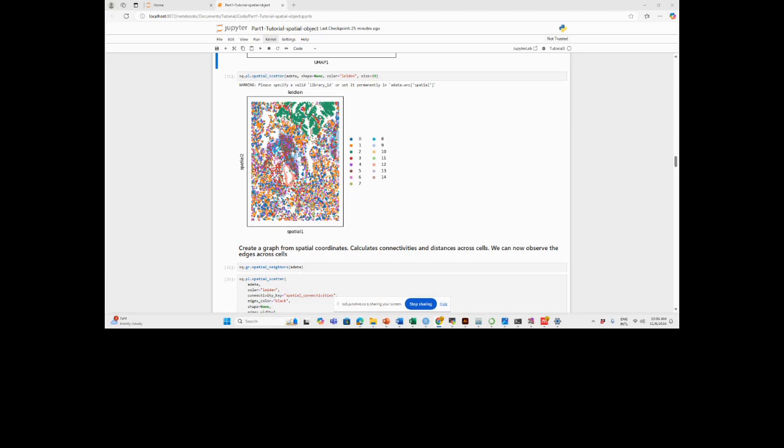You put a question in the Q&A. Is the spatial transcriptomics data and the tissue staining obtained exactly from the same tissue sections? The answer is yes. They are aligned and they are exactly the same sections.